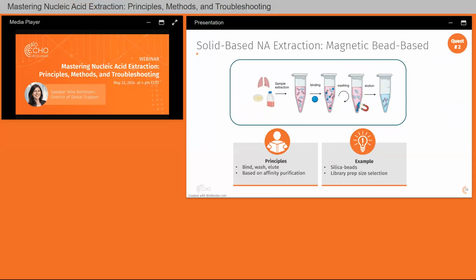Well, we have other solids DNA and RNA can bind to, and those are magnetic bead-based kits. So that means you can not only work with columns, you can also work with particles, like magnets or superparamagnetic particles, which are little micrometer-sized balls in a suspension, which helps you to recover your DNA. This works similar to the silica approach I showed you before, but there could also be pH-dependent beads, so that you're working with shifting the pH to bind the DNA and also to release it.